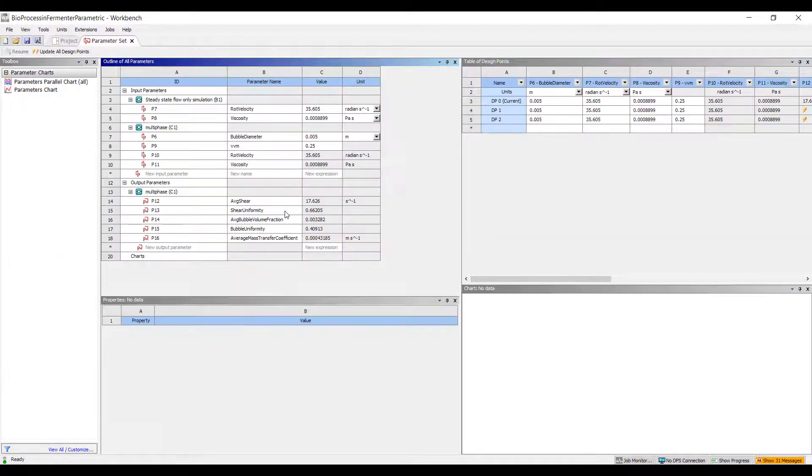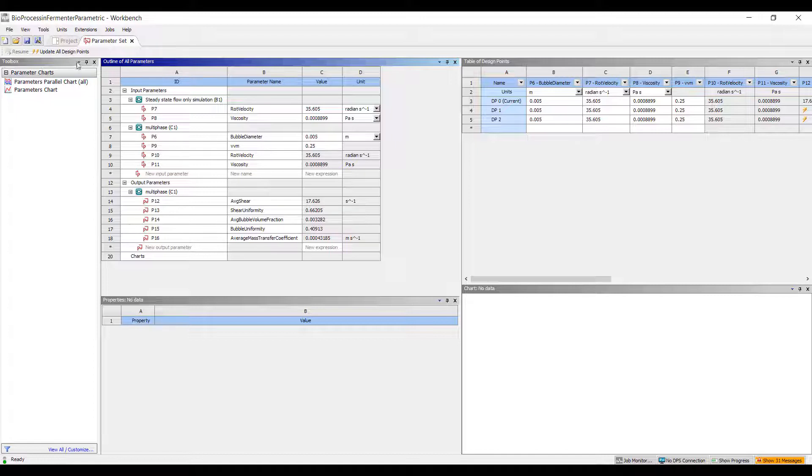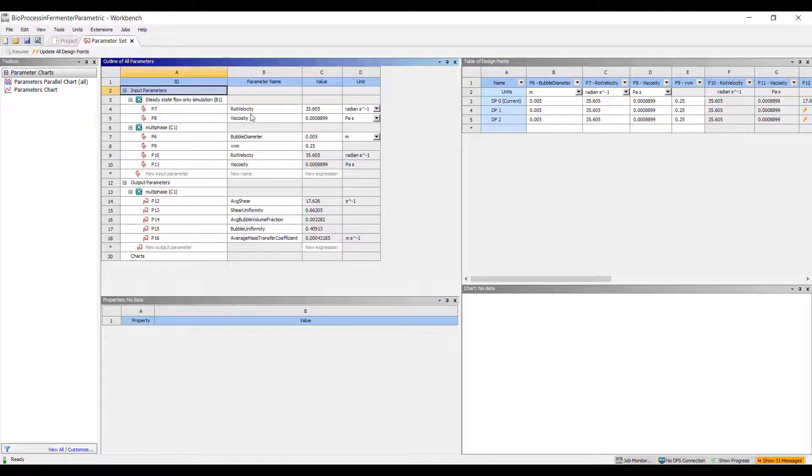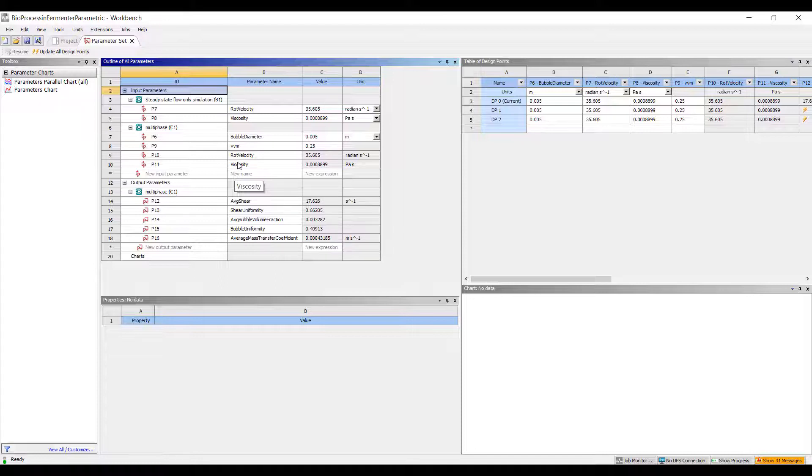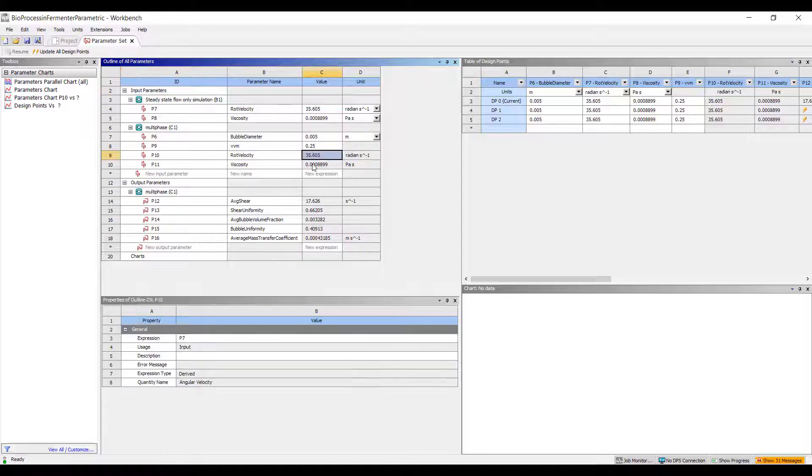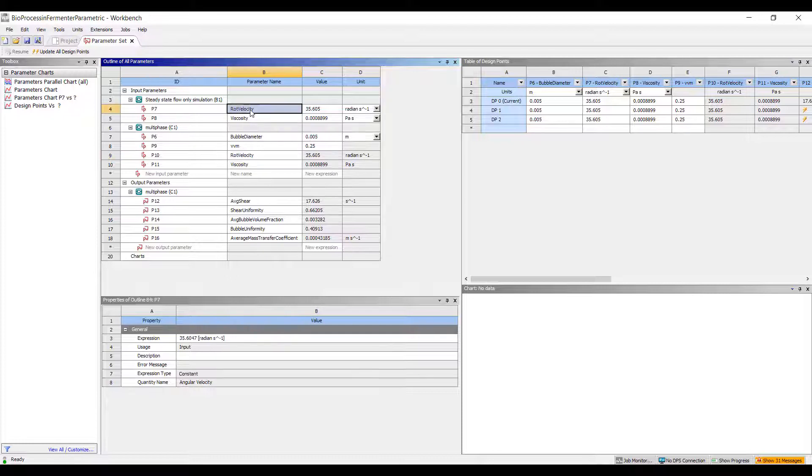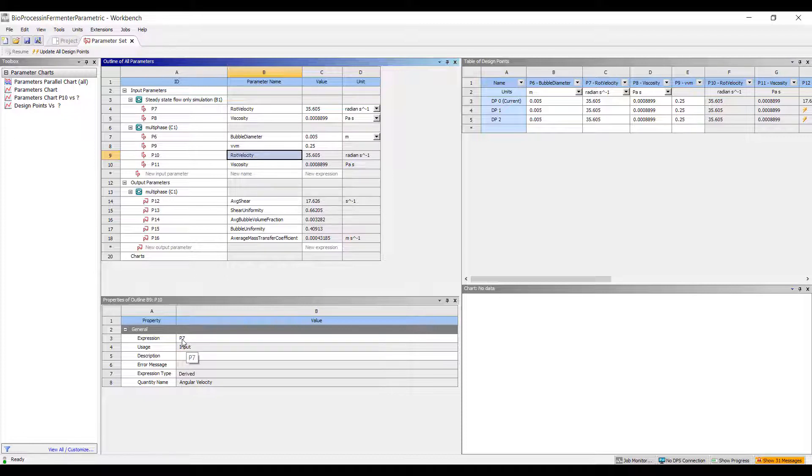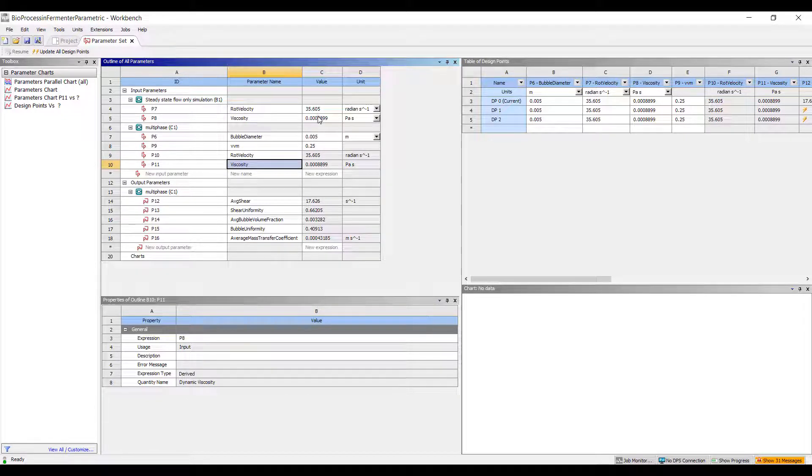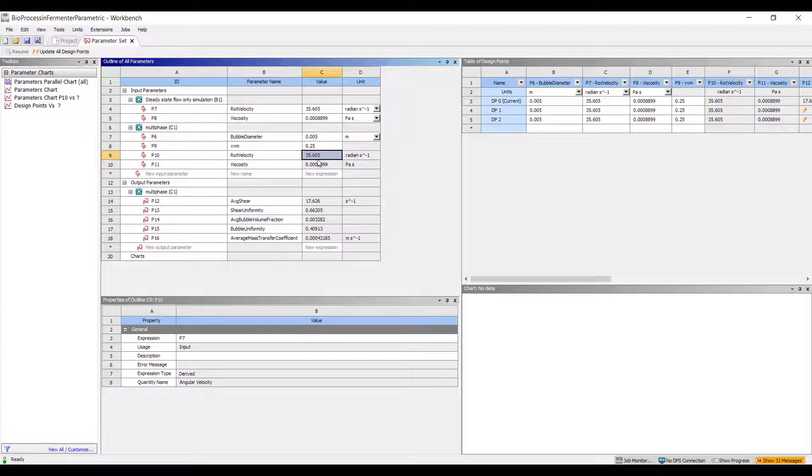Then we move on to the parameter bar. You can see I have a series of input parameters here. There's two in the first steady state simulation and four in the multiphase simulation. We are grabbing five output parameters from my multiphase analysis. Notice that these two are grayed out because I want the rotational velocity to be the same as the input. When I go to my rotational velocity, I can specify the expression to be P7, which will set this rotational velocity to be the same as this rotational velocity. Similarly, the viscosity is set to be the same in both the steady state and the multiphase analysis. So in total, I have four inputs and five outputs.